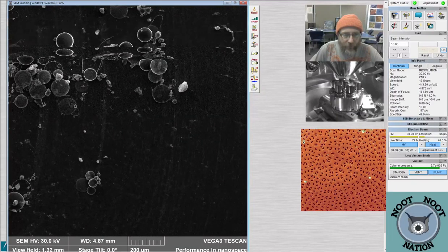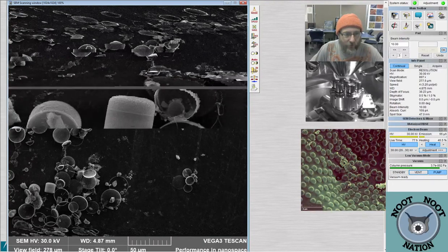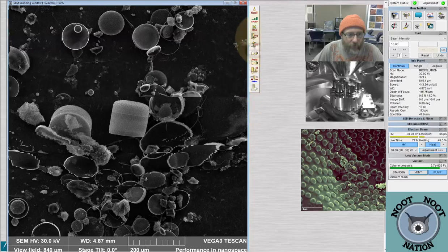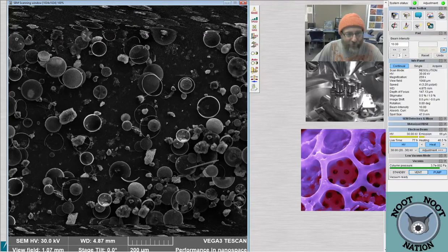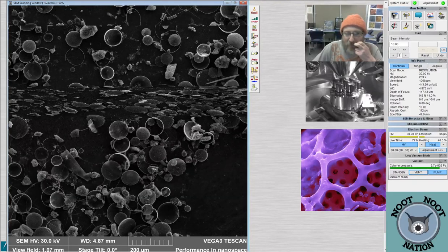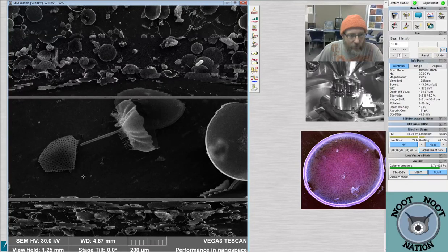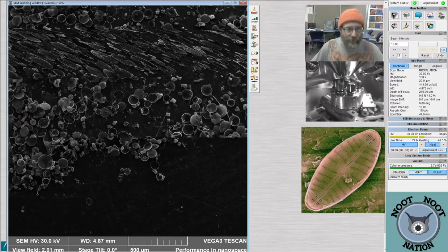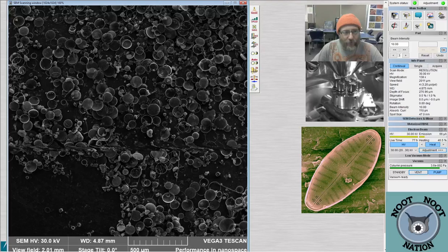So I'm just browsing around looking for something to image that would be a good place to stop with. And there's a lot of cool things on here. This is just Melosira, I believe. I was also thinking maybe I could find that mystery one to tell him about if I looked around a little before we ended. It's in here somewhere, one of these slides. It being quite large though, and I think both valves were present. So I'm curious as to where it would be.